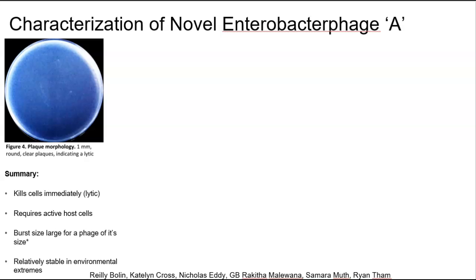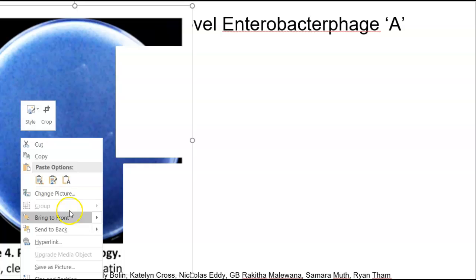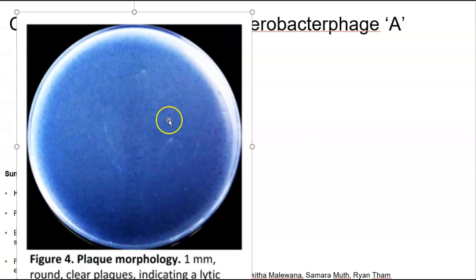So we grow it in bacterial cells, and what does it look like? On this plate in the background, all this cloudiness, that's bacteria growing. You put the bacteria on the plate first, and you overlay a mixture that has phage in it. And if a phage lands, then it starts to eat the bacteria, bacteriophage, or it lyses the bacteria. And what it does is create an area of clearing. So all these little spots here, those are areas of clearing or plaques where a virus is replicating.